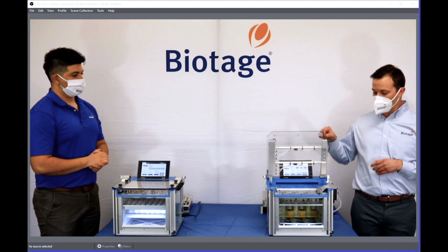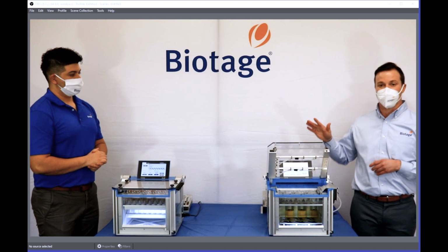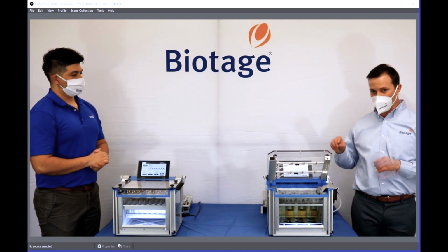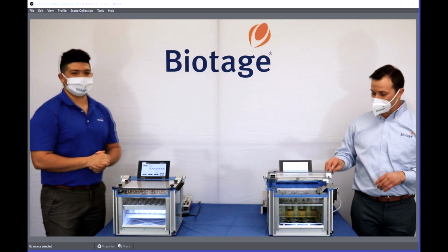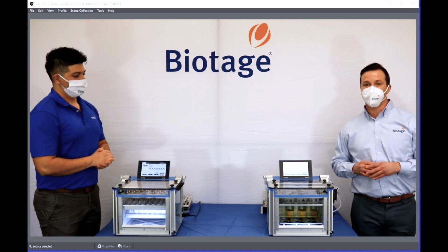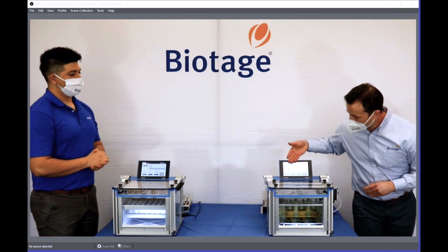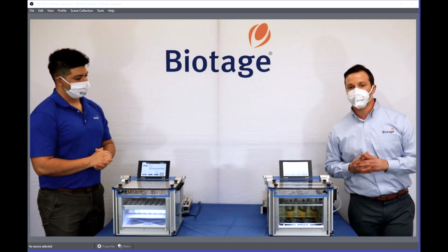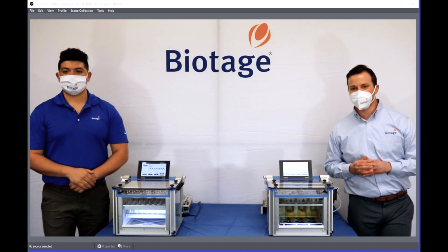And when you close it, if you're a classic user, it actually has a soft close hinge to it. So I've seen labs before have a little cushion to make sure it doesn't bite your fingers. This actually has a soft close, so you can not worry about your fingers getting bitten when you're lifting it. There you go. And it starts right back up at the same nitrogen level that it was paused at. Great questions, by the way. Thank you. And everybody, just 1 more minute.